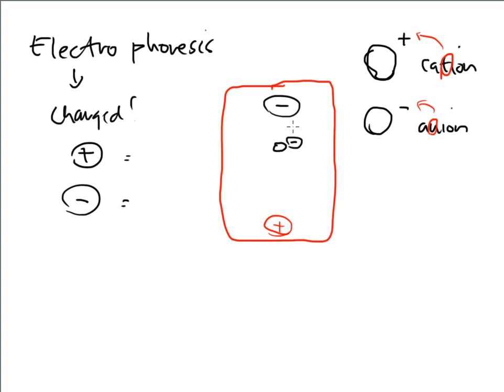That sample is a negative charge, and that negative charge is hanging out, and that negative charge sees that positive there at the very bottom, and it goes, I really like that positive charge. And then all of a sudden, that little negative ion goes down to the positive charged area of the chamber. It begins to move because they're attracted to each other.